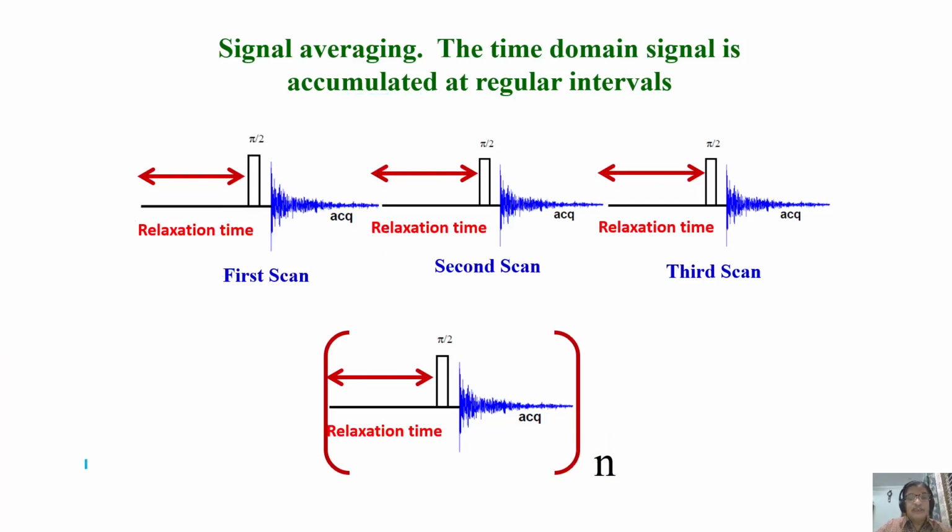We also discussed that the free induction decay starts decaying. This is called time domain decay in the transverse plane. It depends upon the relaxation time T2. It has to decay. If it decays completely, at the same time the signal will be growing along the z-axis.